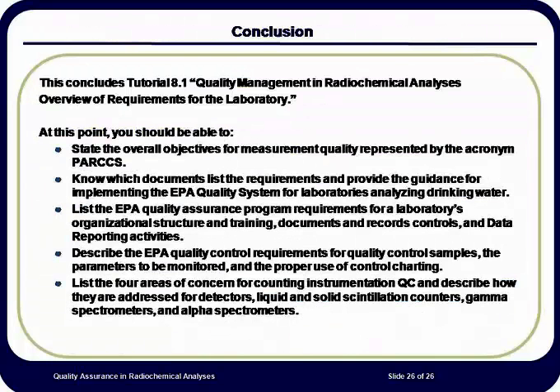This module has provided you with some of the basic concepts of quality assurance and quality control. You should be able to distinguish between these two functions and state why each plays an important role in producing data that is reliable and defensible. You should be able to use the guidance provided by the EPA Certification Manual on quality control analysis for sample batches and instruments, as well as other quality functions for the laboratory.